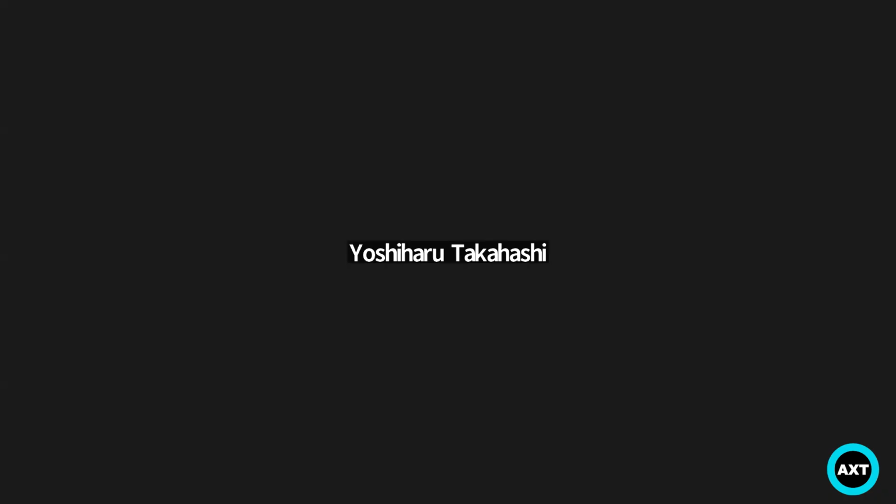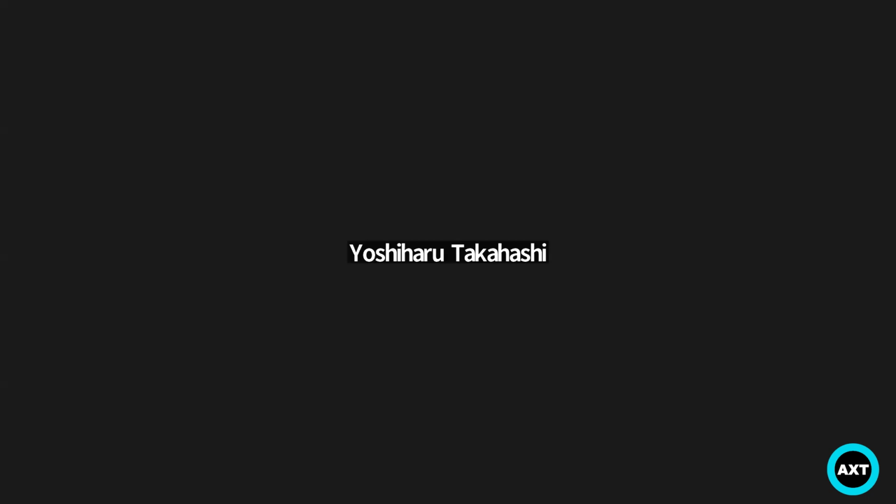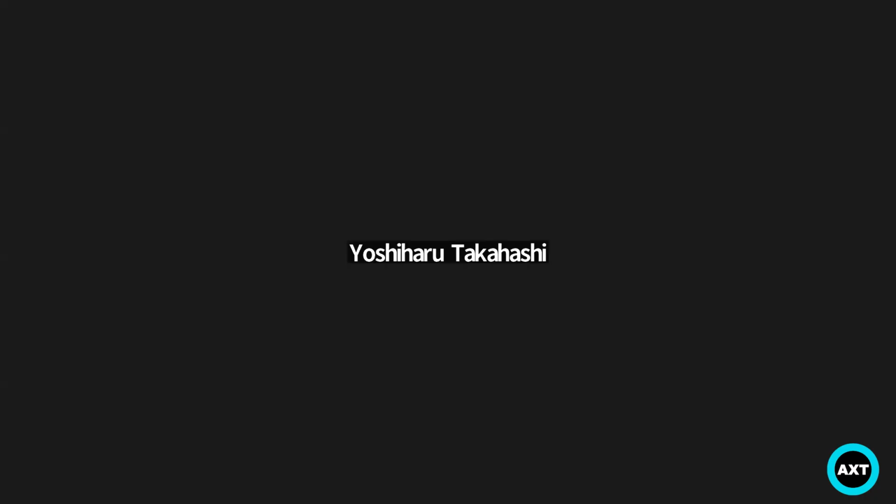Does anyone else have any questions at this point? Can I ask one question, Takahashi-san? When do you plan to release the next system with the tunable laser? Yes, for the tunable laser, we got a contract with the laser manufacturer. So we can manufacture a tunable laser maybe in 6 months of time. Oh, great. That's good to know.